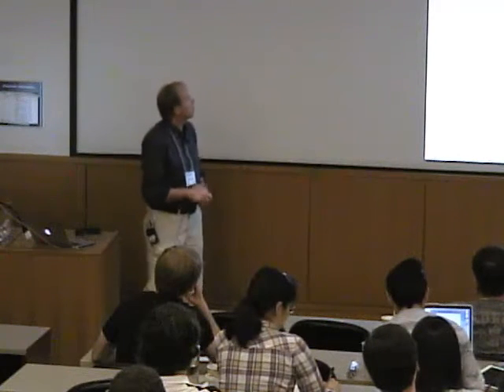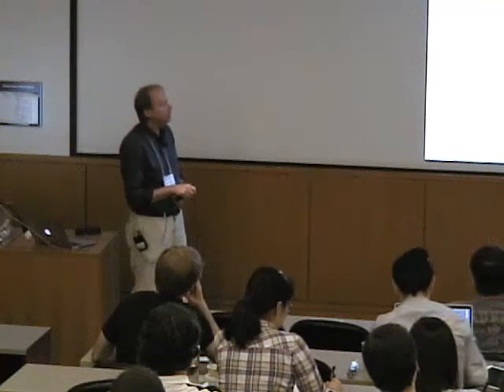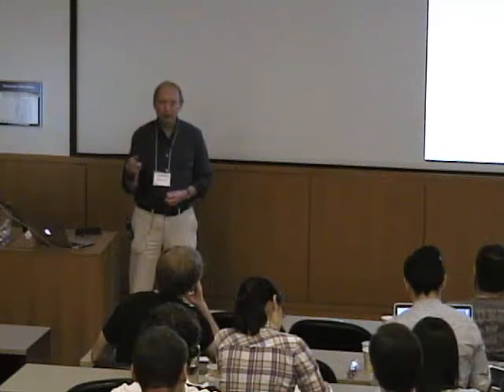Right? And so this just says what I just said. The reflected power that we would see is stronger than what we would measure in a normal absorbance experiment. Right? And so we're not detecting the signal directly. We're not really measuring the absorbance directly, but we're measuring this reflected power out of the resonator. And that gives us an increase in the size of the signal that we can measure.